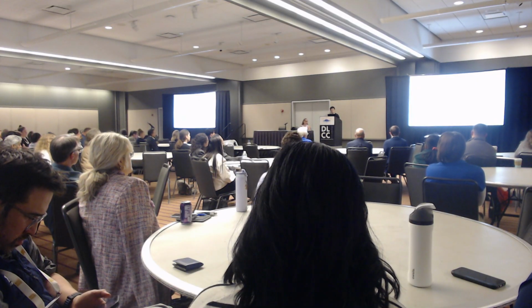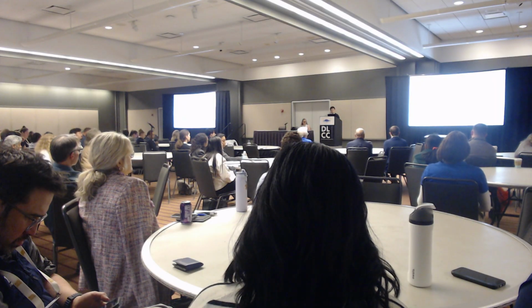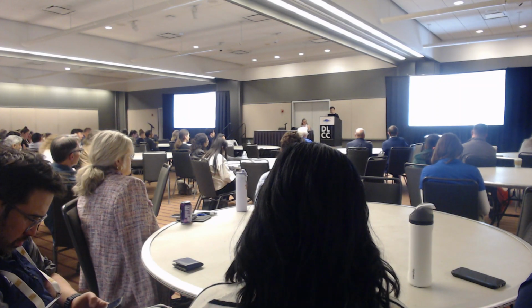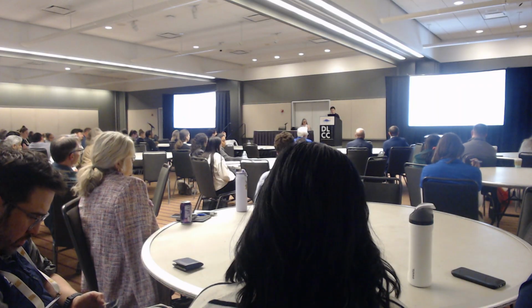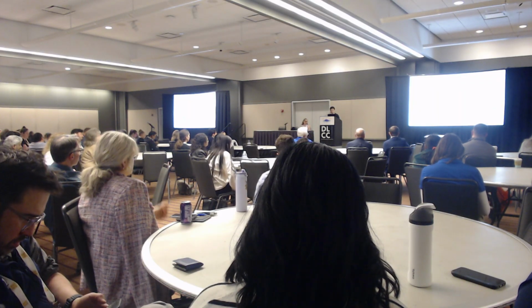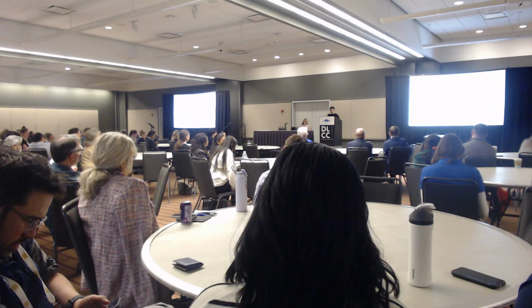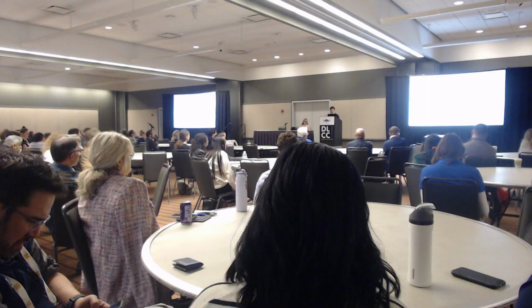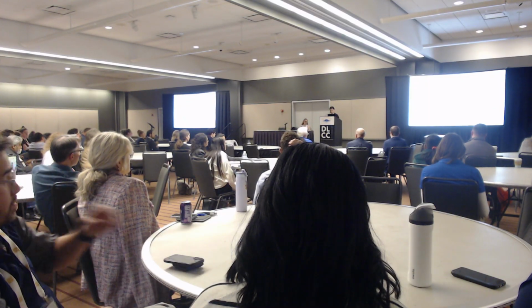Then we moved on to test on the human samples as well, and we tested on the human cerebellum and also human thymus, which also showed very good spatial patterns. And we further increased the spatial resolution from 50 micron to 10 micron using the Atlas Omics flow gel, which showed very good, more refined spatial patterns in the human thymus.